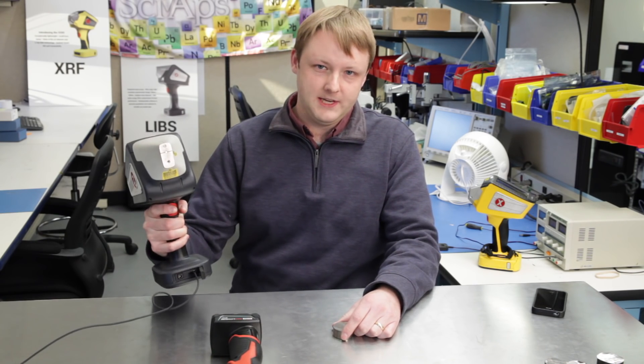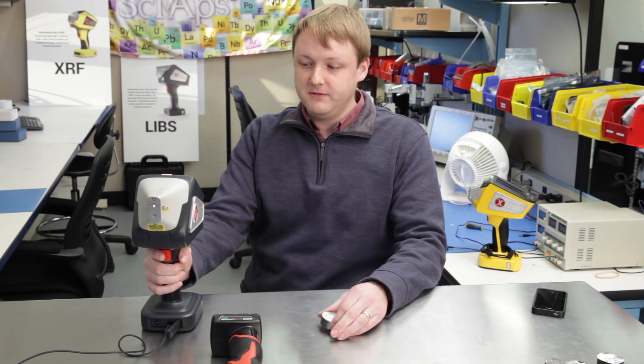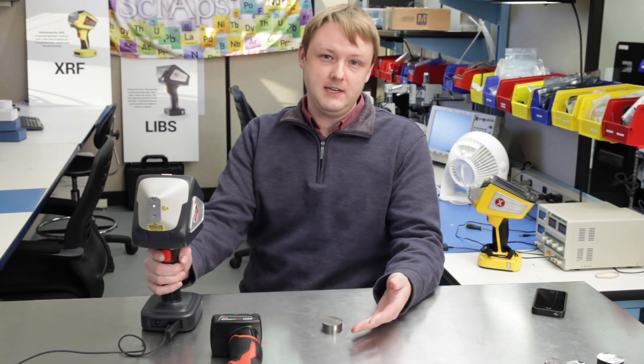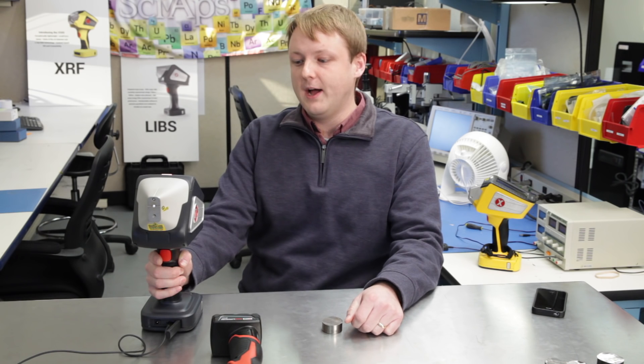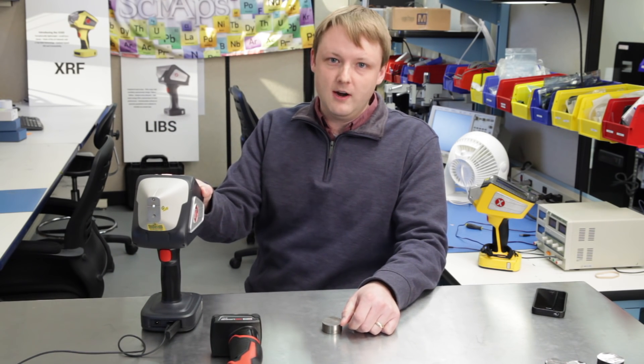We're using a handheld LIBS analyzer to analyze carbon in carbon steels. The main emission line we use is at 193 nanometers, so it's pretty far into the UV. For all kinds of OES spectroscopy, you really need to use an argon purge if you're going down into the UV. So the CyApps Z200 uses an internal argon purge to do our carbon analysis.